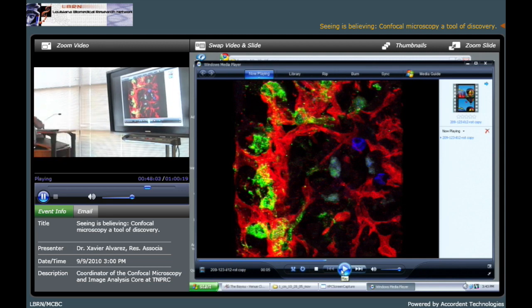This is something that we found recently. Blue is IL-12, interleukin 12, and we see cells that are producing interleukin 12. Red is CD123, the receptor for IL-3.